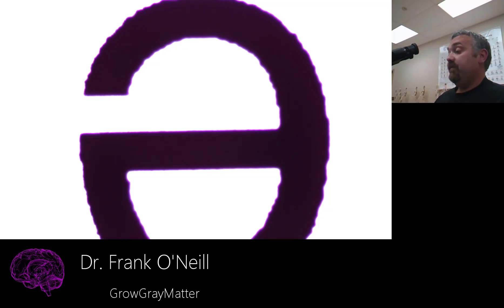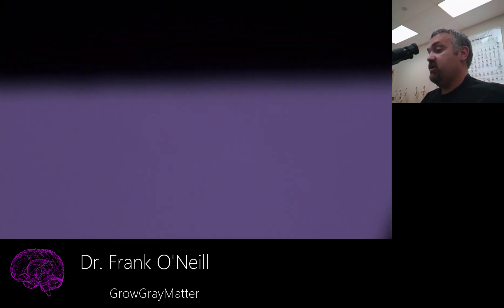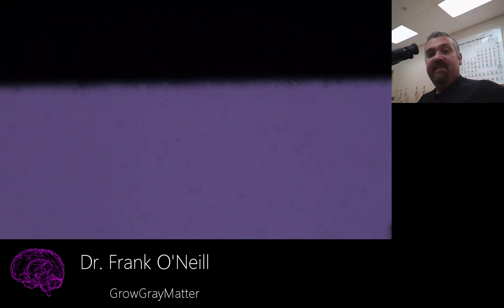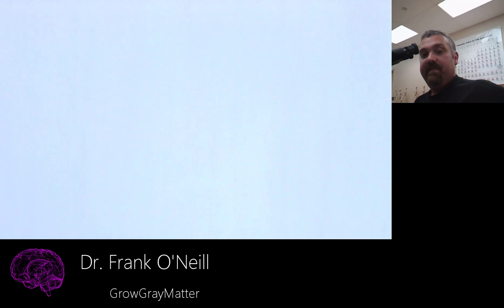Then as we move forward, I'm going to go to the high dry power and get to a total magnification of 400x. You're only seeing part of the letter E. And I can fiddle with the light a little bit here, move this around a little bit, but as you can clearly see, you're only seeing part of the letter E, and that's because as I jumped from a total magnification of 100 to 400, the magnification went up 4 times, and the field of view just dropped 4 times.